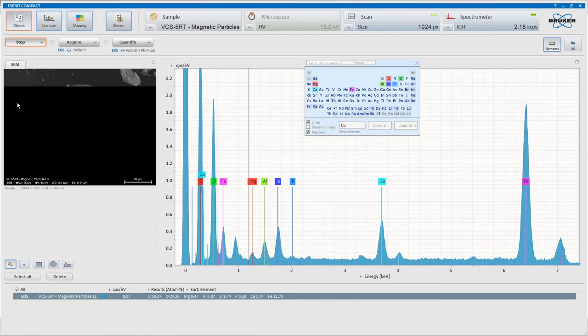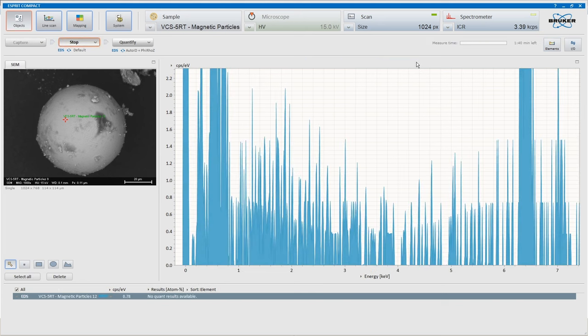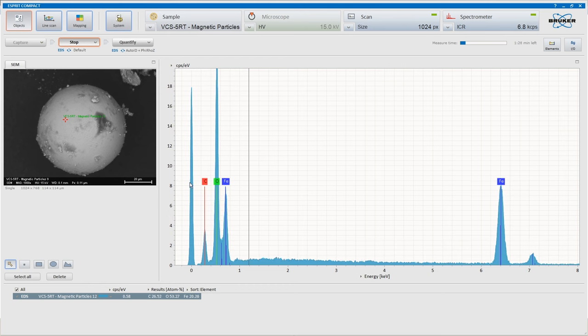So we'll have a look at this bit here. I think this is going to be silicon, but maybe it'll be iron. This will be interesting. Oh, maybe it does have some crenellations, but it's been highly smoothed. Let's see what we can see. Could this be the pure iron sphere with the crenellations broken off it? That would be interesting.